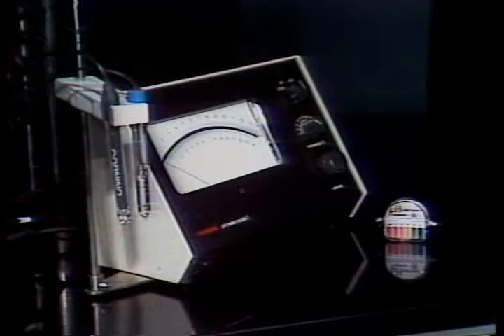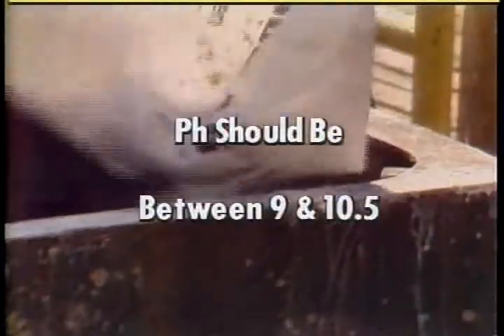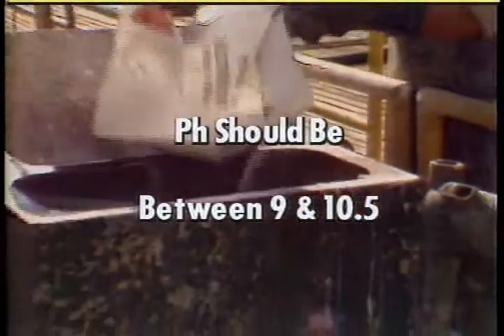This pH meter is used sometimes instead of pH paper. pH affects the mud's ability to dissolve additives. Low pH mud also corrodes pipe and interferes with the viscosity control of bentonite. Caustics are added to the mud system to control the pH level. It should usually be about 9 to 10.5.